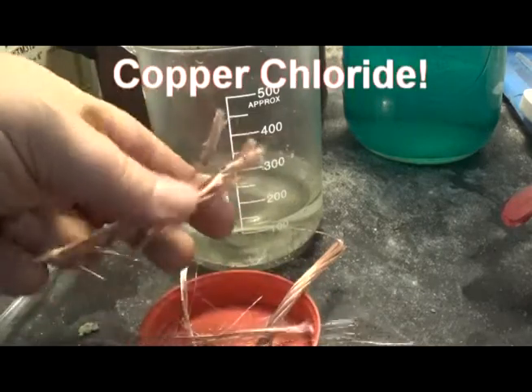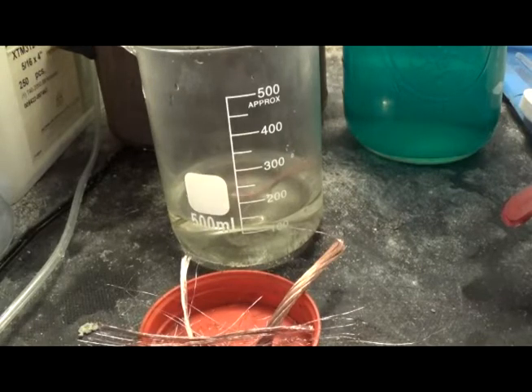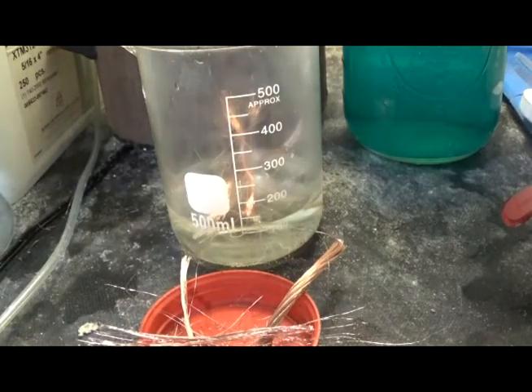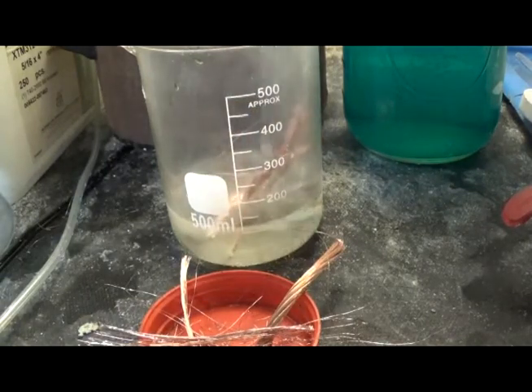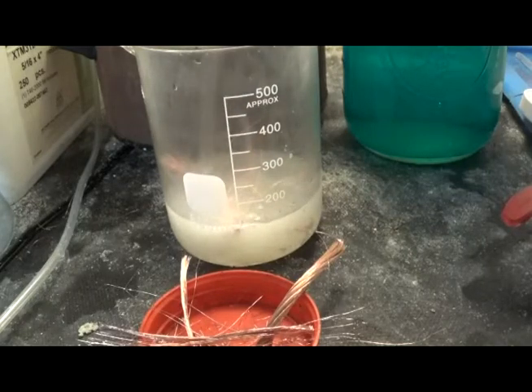This should dissolve pretty quickly because it is very thin. I figured it didn't react that way. Might as well dissolve it.